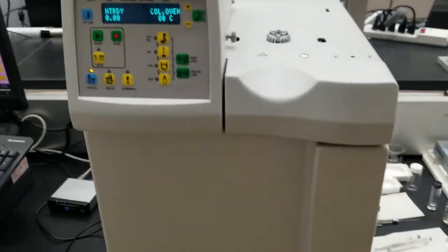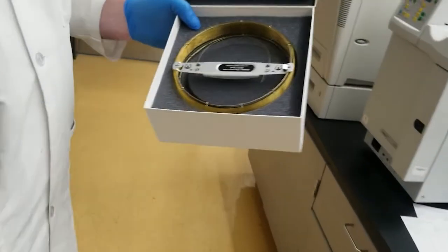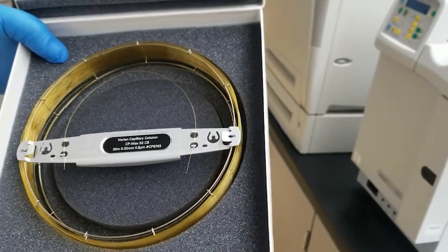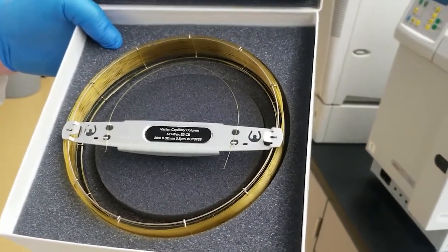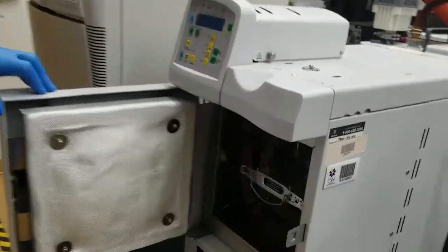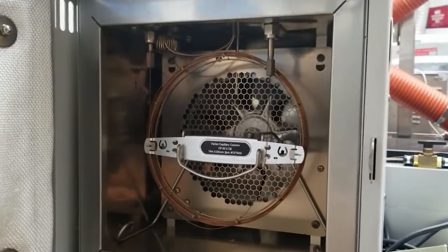Each of these has a detector that will determine the signal when the compounds come out, but the compounds need to be separated. The way the compounds are going to be separated is by pushing them through a capillary column that will separate compounds based on their mass and their retention time in this column, and they are pushed through with an ultra pure helium carrier gas. Inside the gas chromatograph, there's a column oven that heats up that column, and then the compounds will take less time to travel through as the temperature increases.